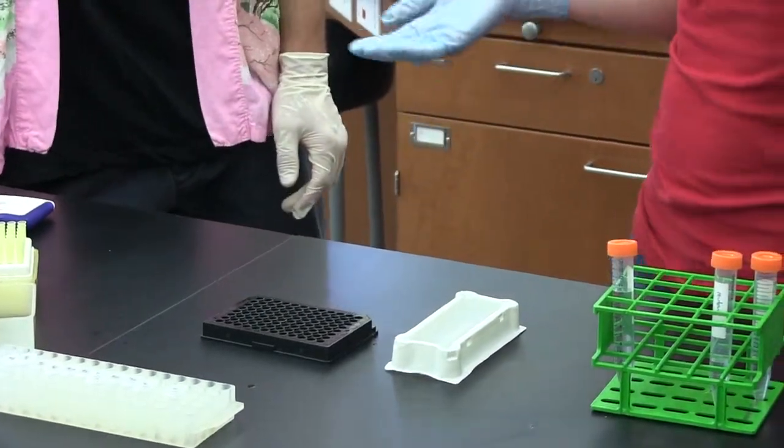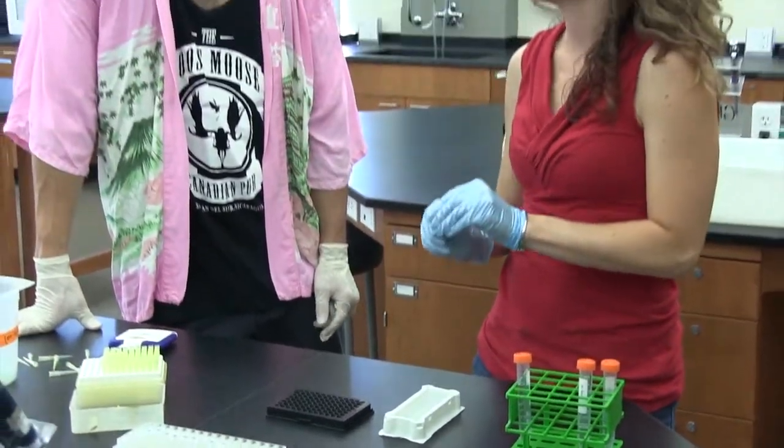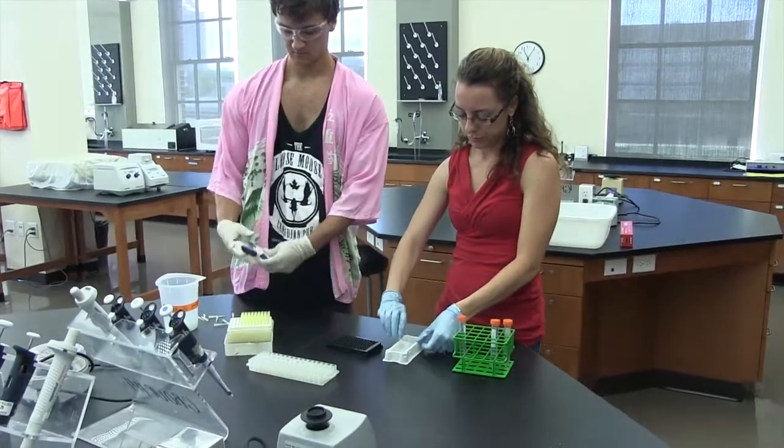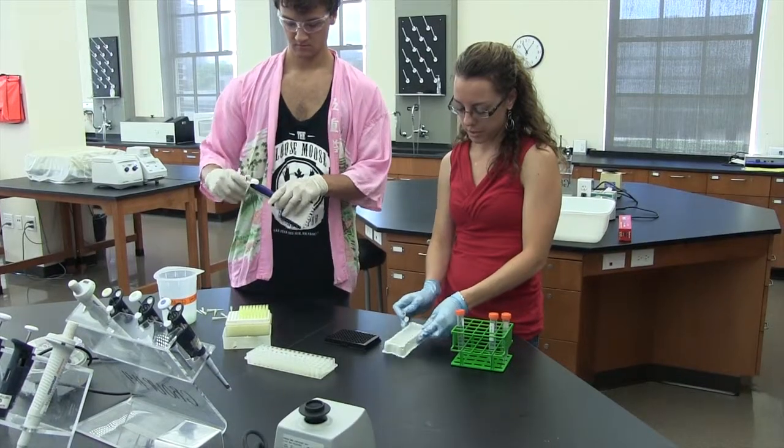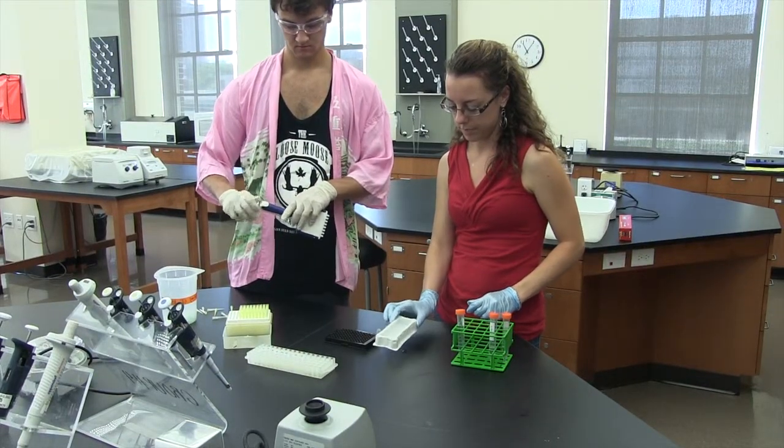So then at this point you would use the multi-channel again and do the same thing to add each concentration of urea. So these are 1.5 mL stocks, which is enough to fill the center of these little well things.